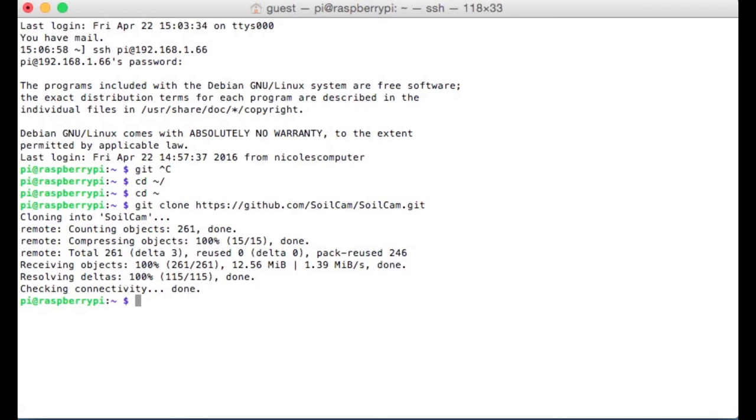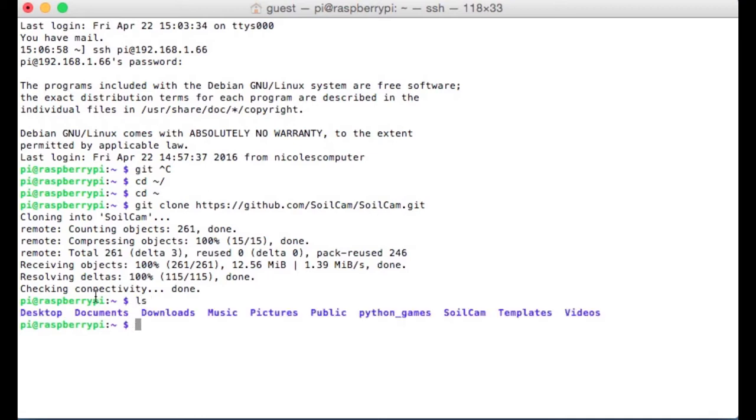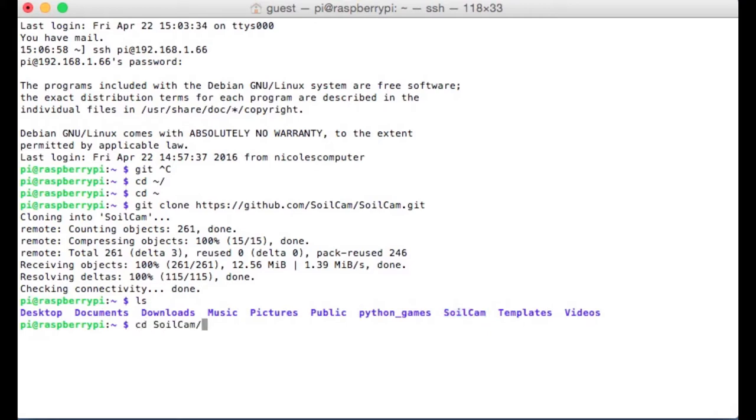So Git is some version control software. We're just using it right now to download the soil cam script. So if I type ls, the listing of files in this directory, we can see there's a soil cam directory now. If I go in there, there's two files, readme.md and then the actual script, soil cam dot sh.